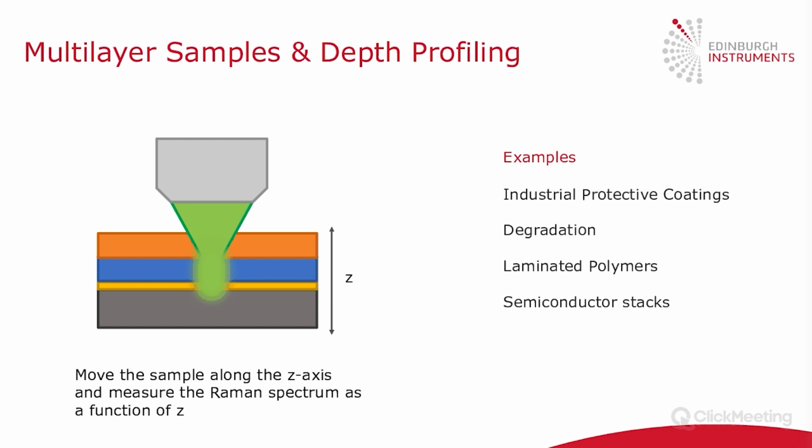So we would like to use Raman microscopy to image how these properties change as a function of depth, or identify different properties at different locations through the sample. And this is something we can do using Confocal Raman. But we have some challenges to overcome to do it.